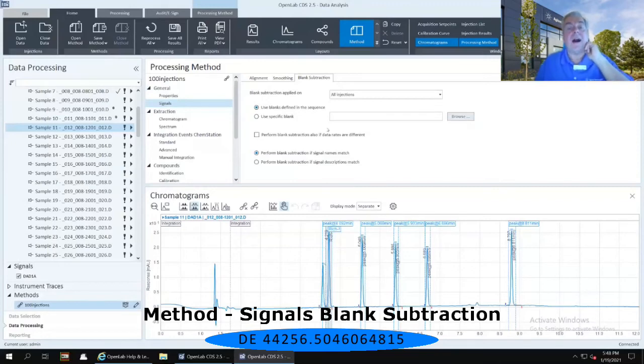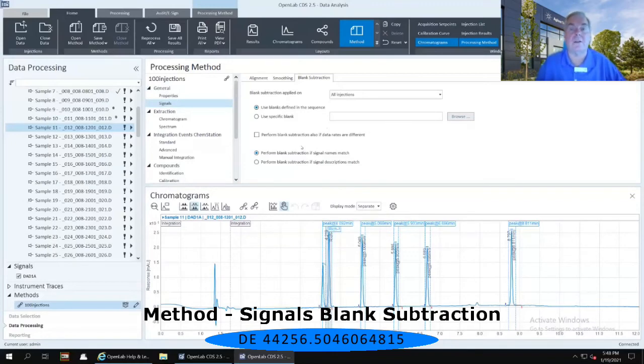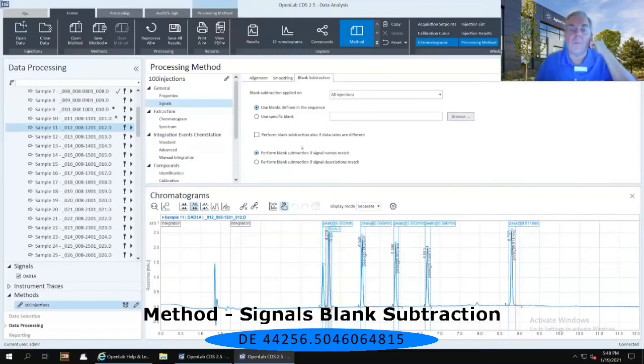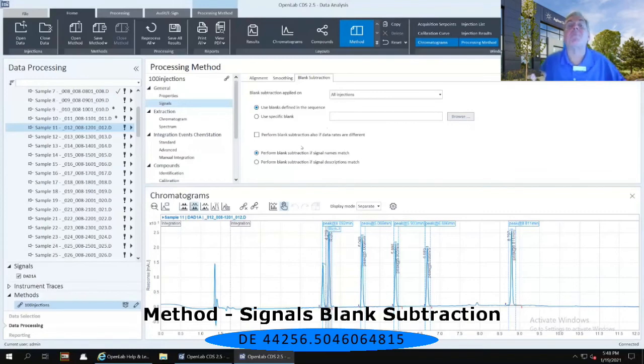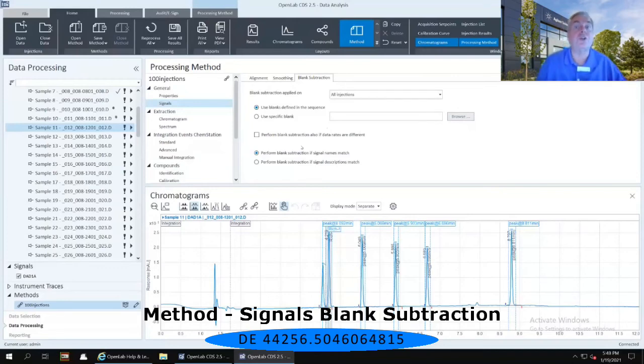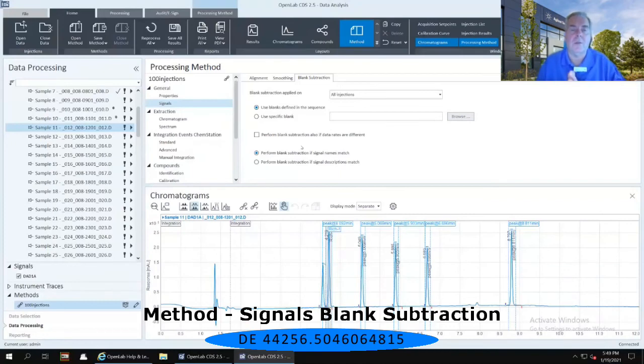Then I have options down below as to whether to perform that blank subtraction if the data rates are different. So if I have changed the hertz on my diode array detector from 60 to 65, do I still want to be able to do that blank subtraction? And if I want to perform a blank subtraction if the signal descriptions match. So, do I want to do a blank subtraction from a diode array detector to a diode array detector, or am I concerned about that at all within my data?